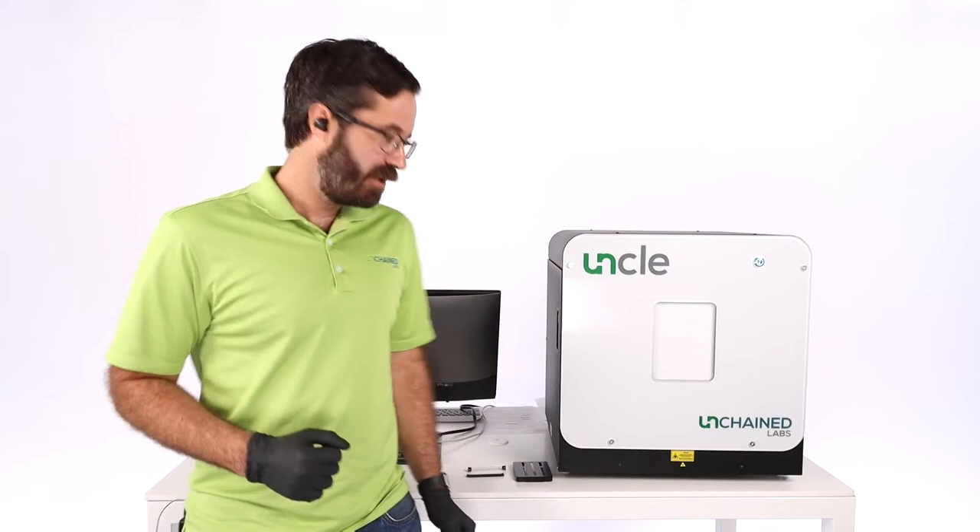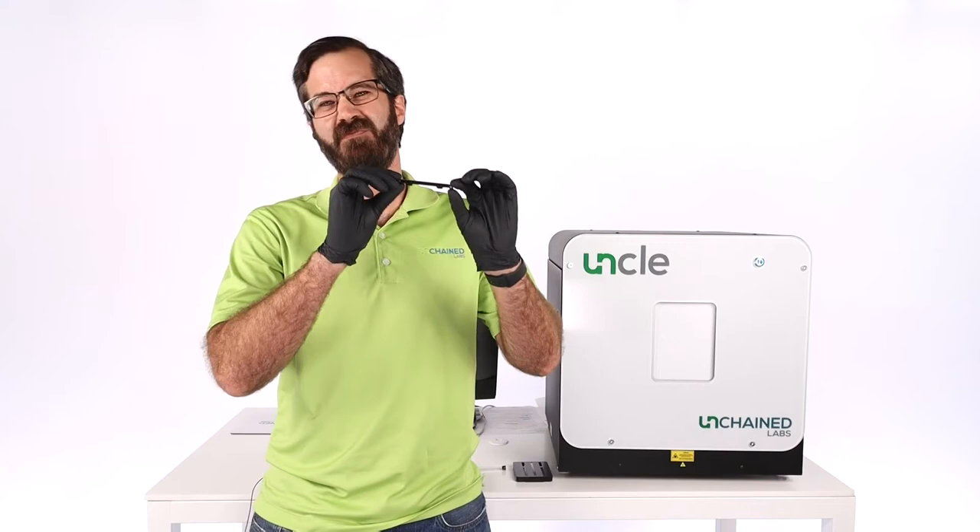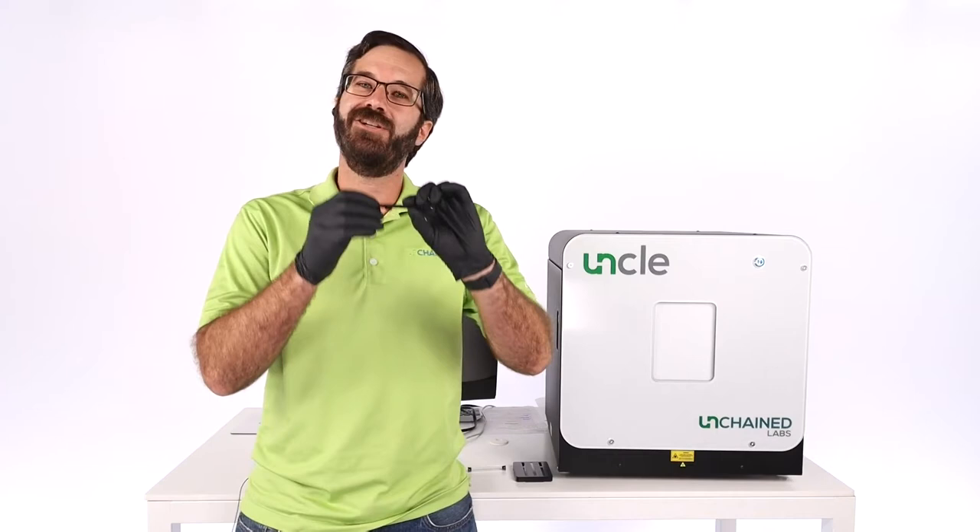The other thing that UNCLE uses, in addition to all those technologies, is this — it's a sample holder which we call the UNI. It's pretty small on camera right now, so let me walk over to our sample preparation bench and give you a closer look at the UNI and show you how to load sample.